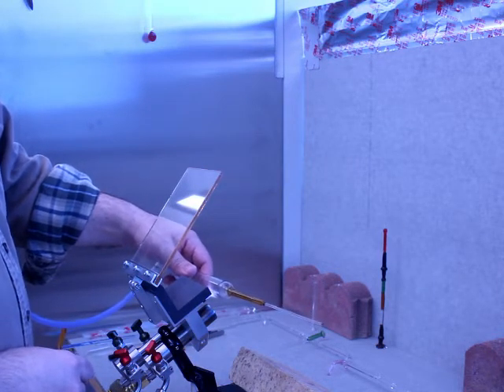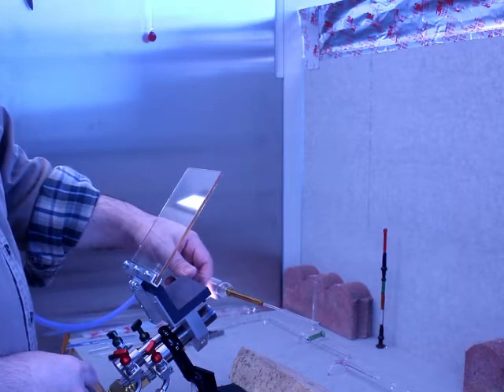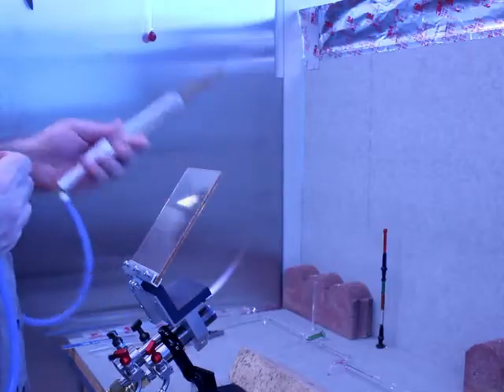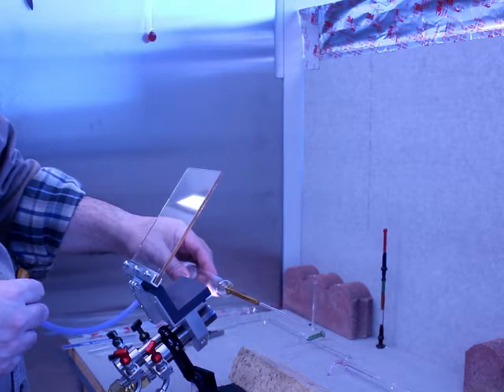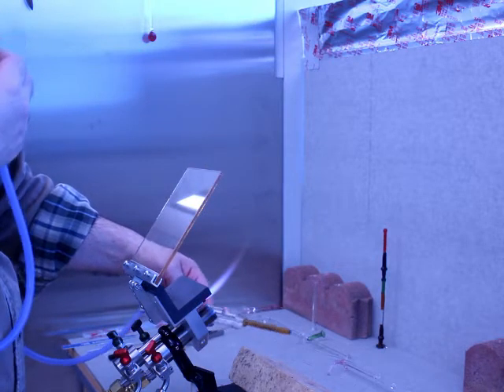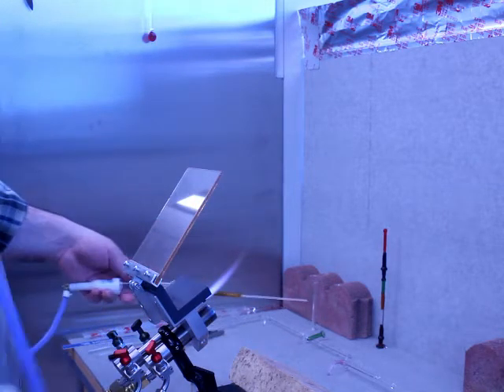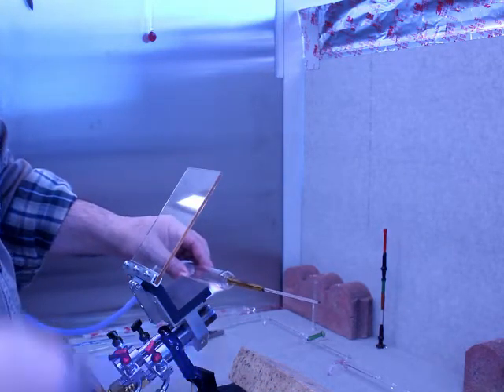For making a side seal, I actually prefer doing this with the hand torch, but I don't have the setup for the hand torch right now, so I'm just going to do it with the bench burner. So I heat that up. You can see I've made a little indentation, a little bulge of where that's going to be my side seal. And I'm trying to make a small hole because it can definitely get bigger as this goes along.